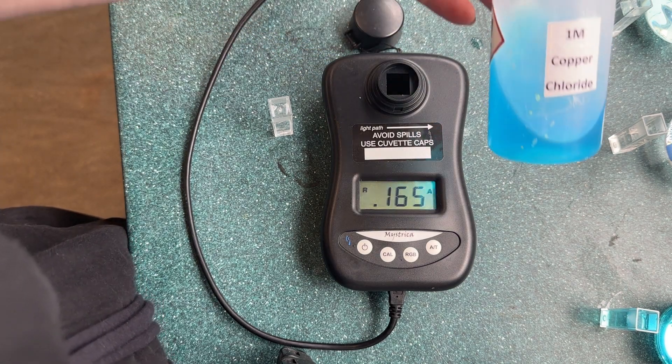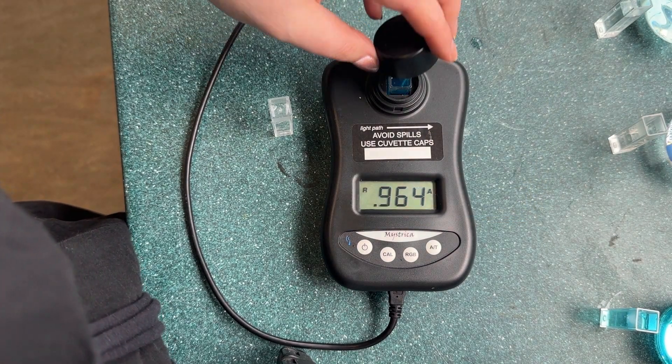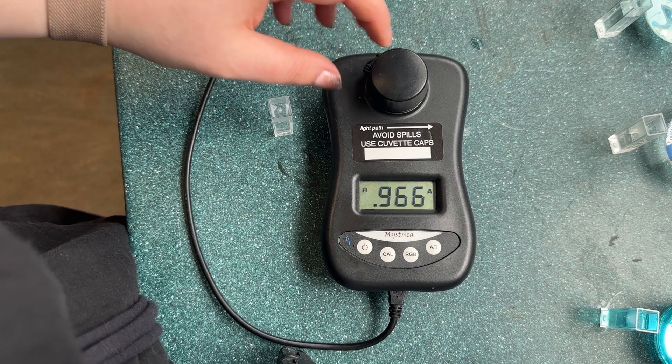Our final reading is with the 1 molar copper chloride solution which has a reading of 0.967.